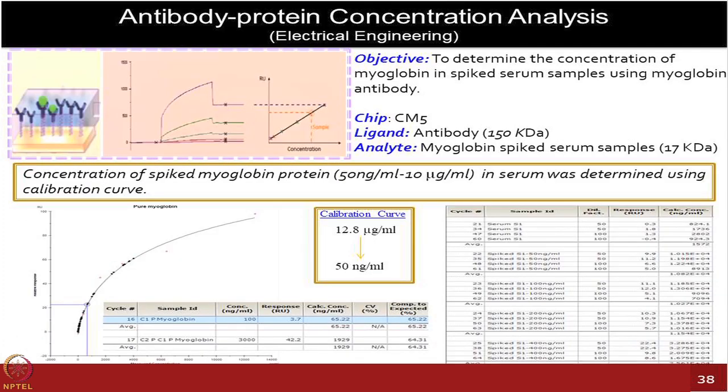Another lab from electrical engineering has the intention of having some benchmarks. So let's say, with Biacore technology, the benchmark available in the field, you can measure an interaction and generate a KD from Biacore. Now if you develop another biosensor and you can show that it generates the same kind of KD, then probably you are talking about a really robust platform development, right?